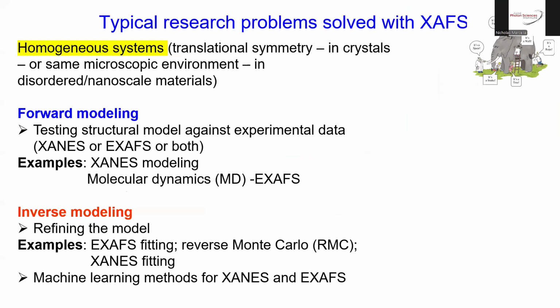The electron energy to be excited will match the incident photon energy. Not all electrons, it's a statistical process, but some fraction of them will be excited from all atoms in your system that are feeling the X-rays. And if some of them are in one environment, some in another environment, and another in a third environment, a mixture, right? You will have some reduced, oxidized, neutral atoms of the same element. The signal will have an intrinsically weighted average of all of these environments.